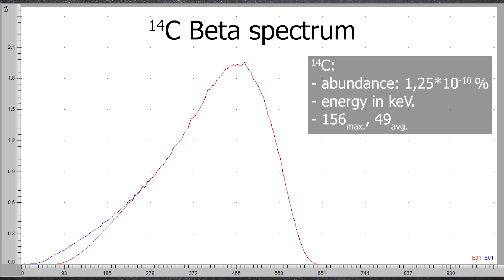Alphas can also be measured with the device, but we don't do that. Additionally, it requires extra software, which we don't have. So it's possible, but we don't do it here. Thus, the LSC is the only device with which we can record beta spectra.